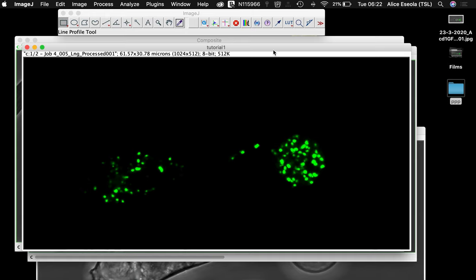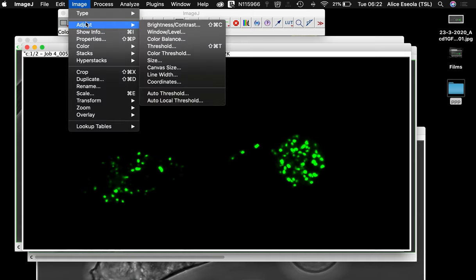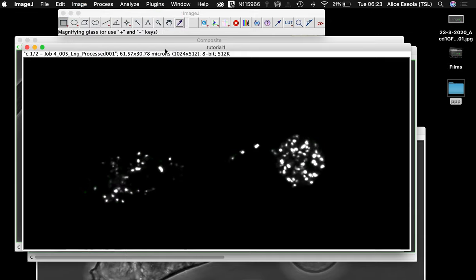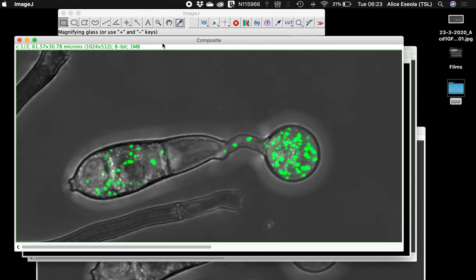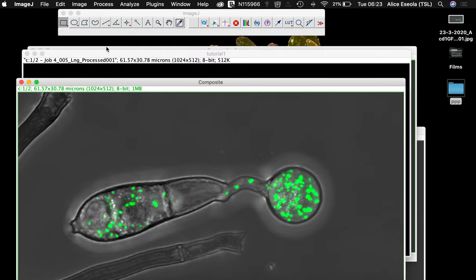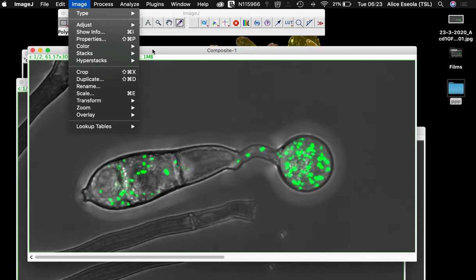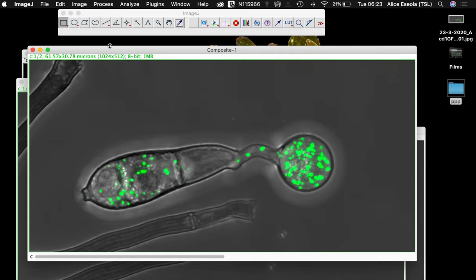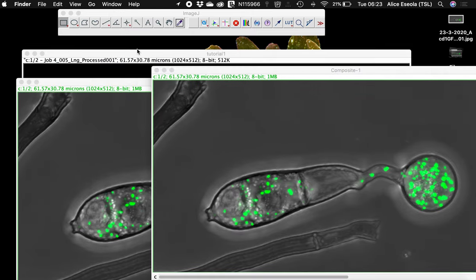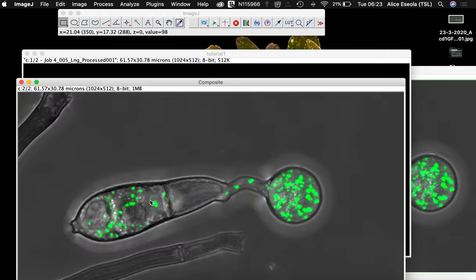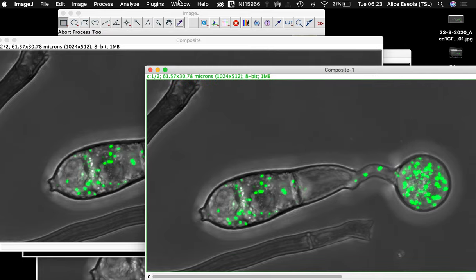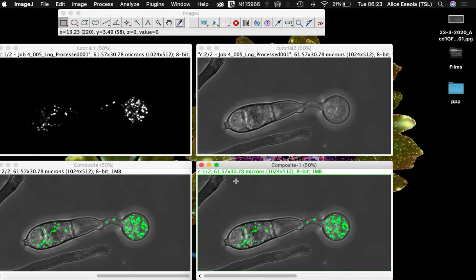When this is done, you need to ensure that your image is converted to 8-bit. Once you've done that, you can merge the image samples together. Like here, I've merged my fluorescence channel together with my bright field channel. That's why I'm having this merged channel showing.